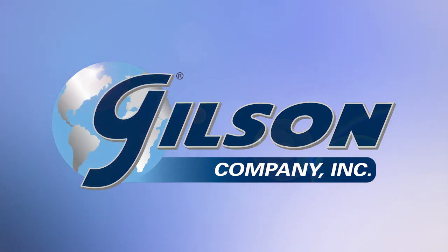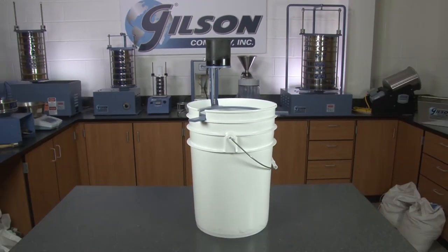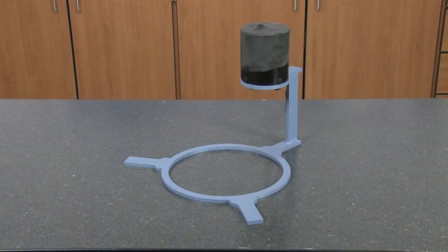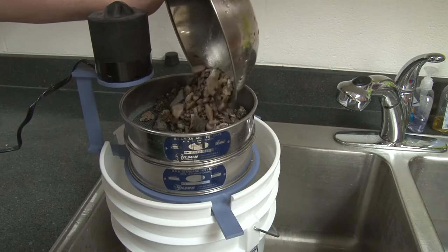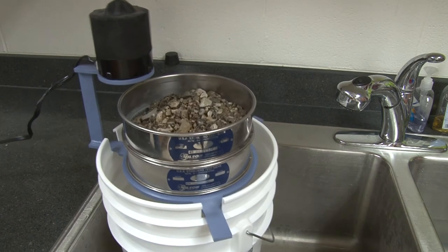When you want fast and reliable separations of wet or dry materials before final processing, then Gilson is your best choice. The Gilson SS23 wet dry sieve vibrator is an economical electronic sieve vibrator ideal for quick scalping of oversized materials from bulk samples.